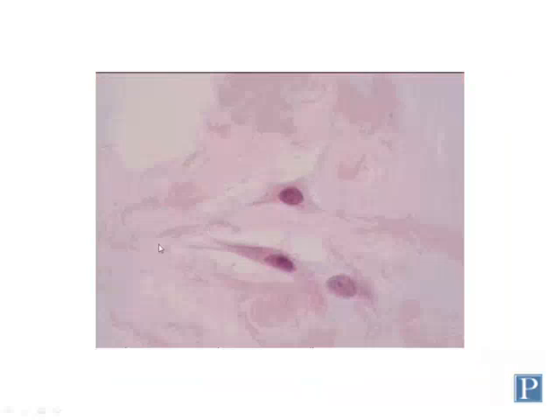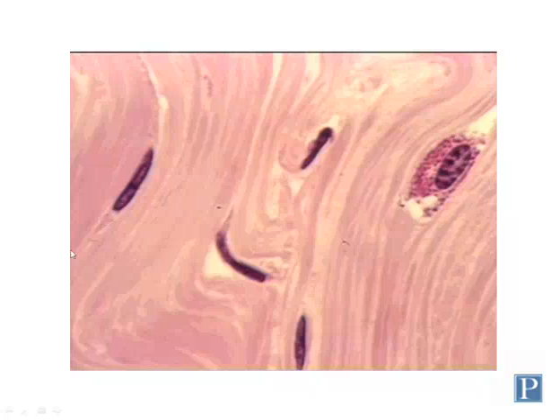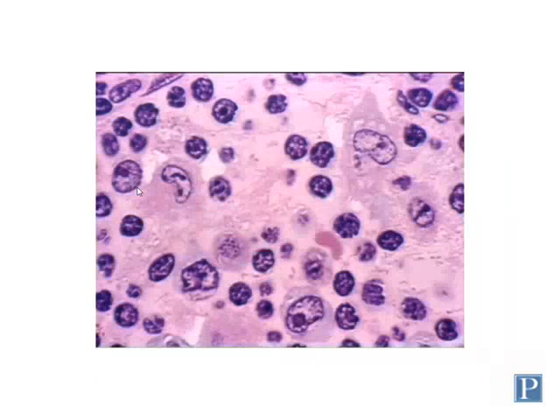Here's a higher magnification view of a couple of active fibroblasts right here, and so you can see the cytoplasm quite well. Oftentimes they have these sort of star-shaped appearances. This is said to be a stellate appearance or morphology. And so if you can see cytoplasm abundantly, then we classify those as active fibroblasts. So be able to distinguish active fibroblasts from the skinnier, more spindle-shaped inactive fibroblasts.